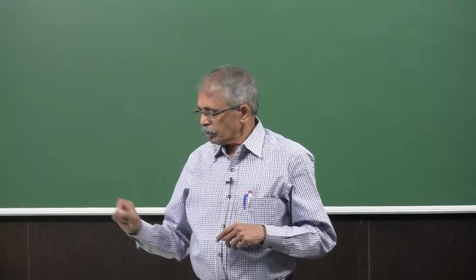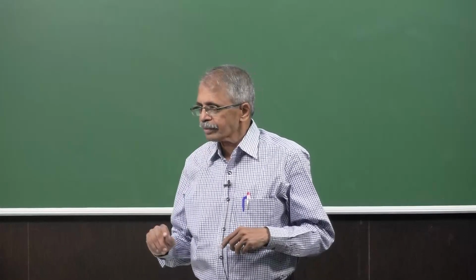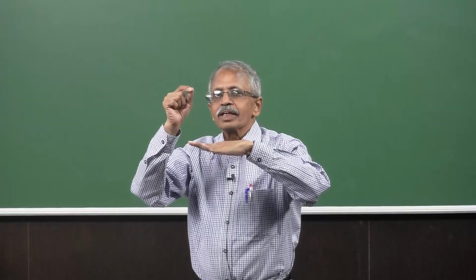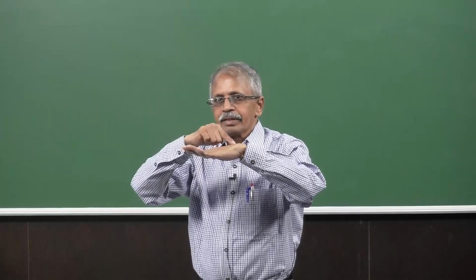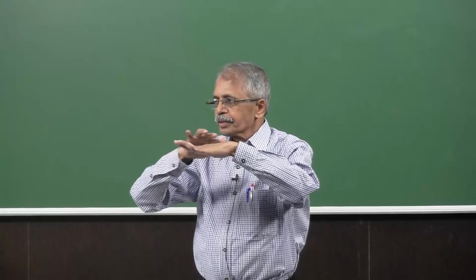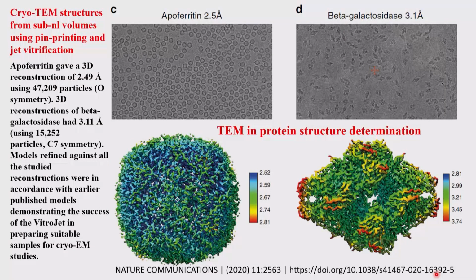not the size of the pins that we are talking about, much smaller, where the tip cannot be seen by our eyes, and you try to drag that tip, which is dipped into the solution, on the surface. That will carry a nanoliter level amount of solution, and that solution is spread by dragging. You can drag in X, Y. You don't require Z, you should not, because it will become bigger. So X and Y direction, and then you leave it. That will give an ultra thin layer, and after the solvent dries you will find each protein molecule.